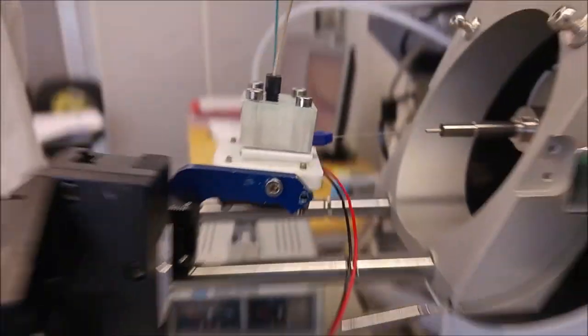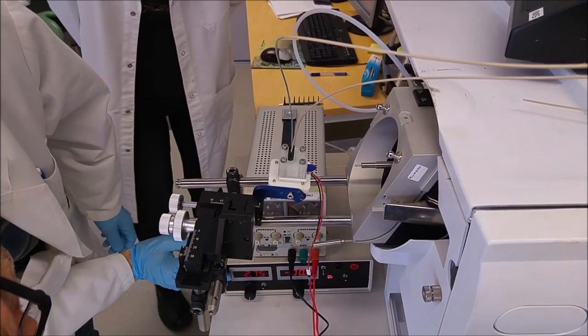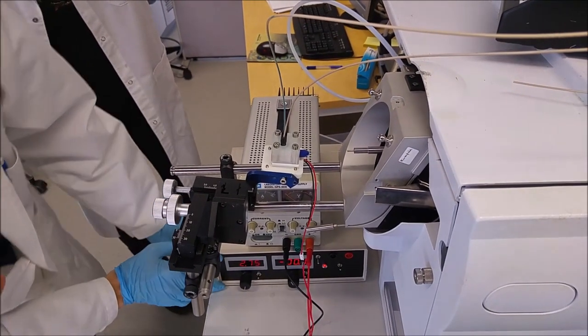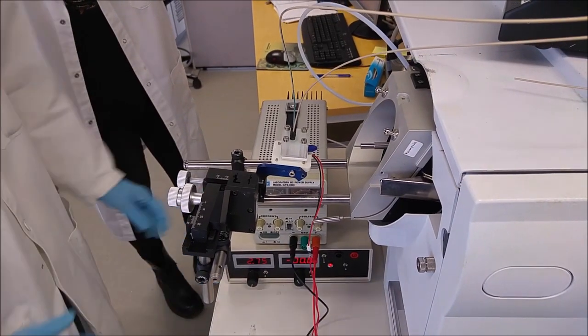Let me just add that the activator for the stirring bar is just a simple computer fan. Here this fan is attached to a lab power supply. This other lab power supply is actually a high voltage power supply which is used for the electrospray.